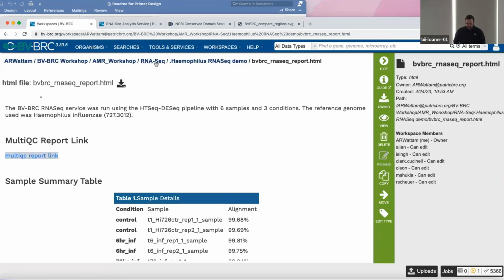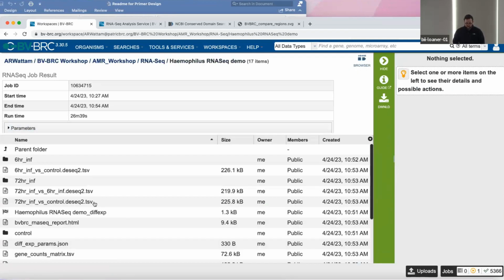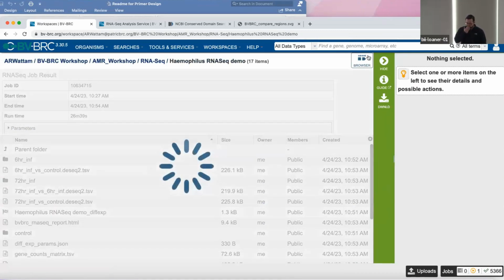All right, and the last piece of functionality I want to show you for RNA-Seq. One of the common ones is you also want to be able to view the BAM files that are output from RNA-Seq, and you can do that by clicking the browser button here in the top corner. This will essentially go and track down all the BAM files in your subfolders here and take you over to the genome browser.